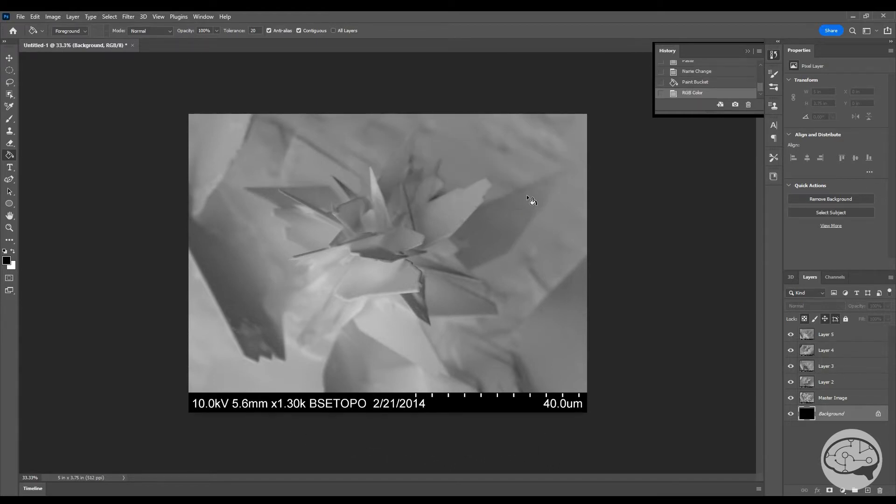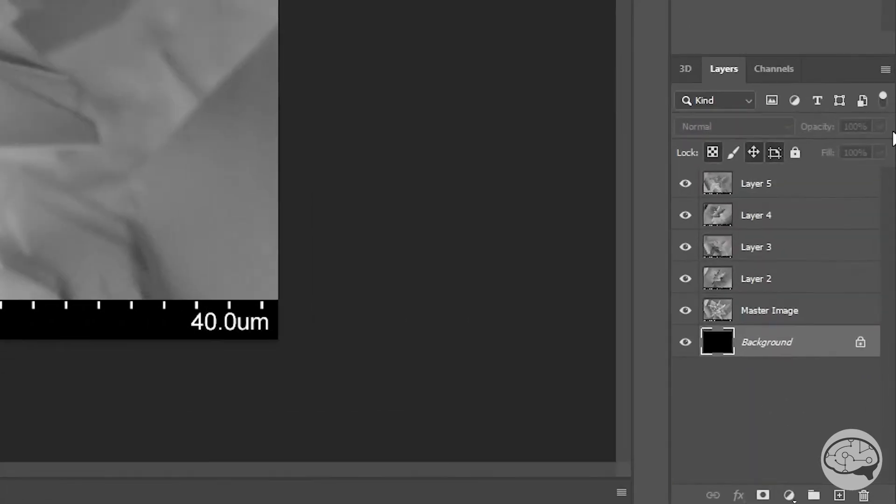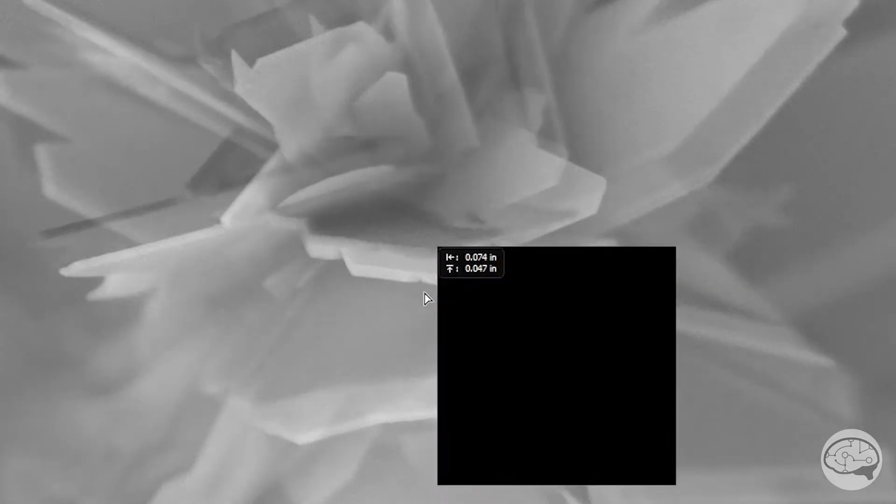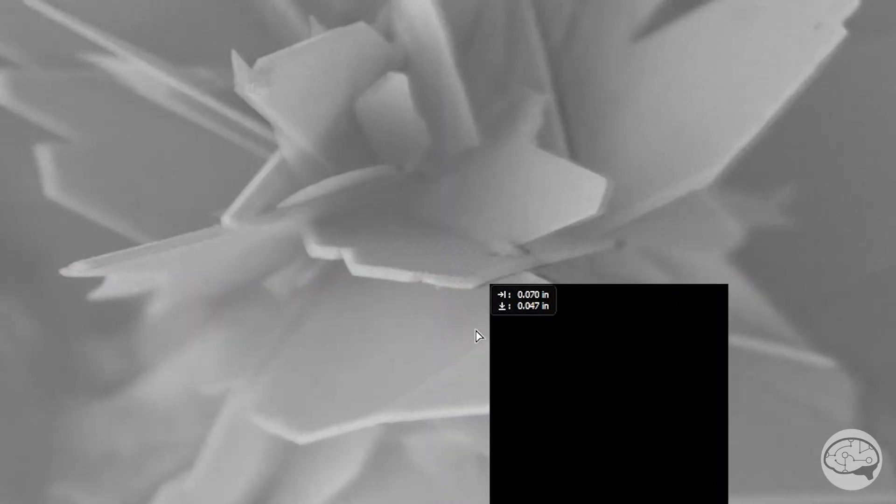Now we need all these images to line up, and they should, but depending on your sample, your stage, or the phase of the moon, they may not line up exactly. It happens sometimes, so we might need to align these layers a little bit. To do that, make sure the master image is at the bottom and turn off all but one of the BSE images and set its opacity to 50%. You should be able to see if it's lined up or not fairly easily. If it's not, then use the mouse and the move tool to drag the color layer around so that it's close. You can then use the arrow keys to move the image around by single pixels until it's lined up. Do the same thing with the other color layers until everything is nice and straight. Always remember to move the color layers around and line them up to the master image and not the other way around.